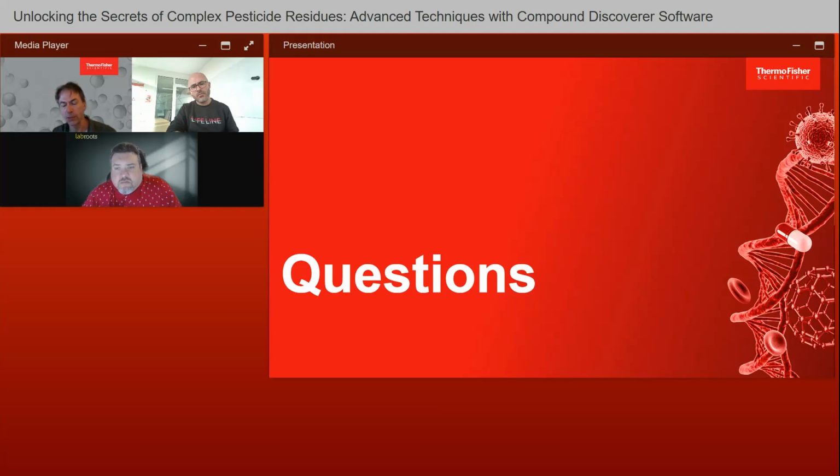If a connection to MZ Cloud is available, then it can use MZ Cloud as an additional step to validate this information. Since on MZ Cloud we have low collision energy information available for pretty much all these standards that are on MZ Cloud, we can use that information as a step to confirm that this really is an in-source fragment, right? And avoid false positives. So it's an optional step. In our experience, the specificity is better if MZ Cloud can be used, but it is absolutely possible to also annotate in-source fragments without using MZ Cloud.